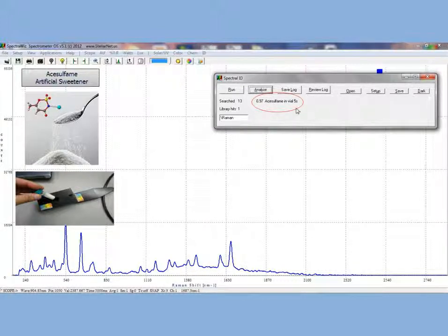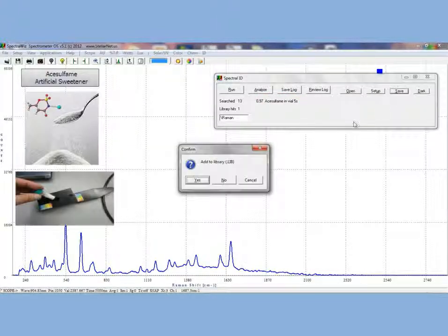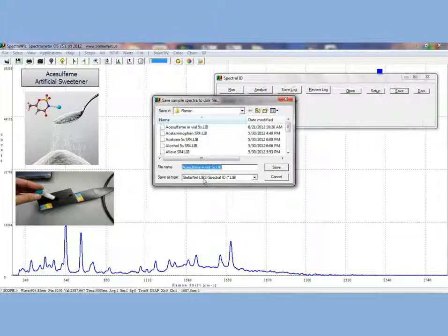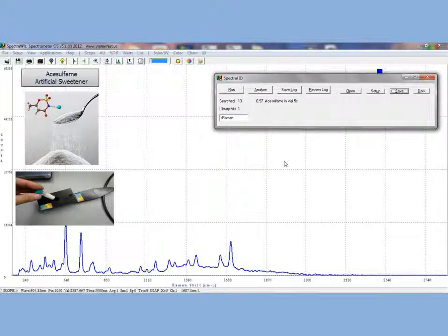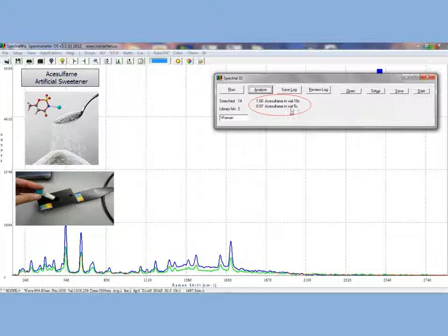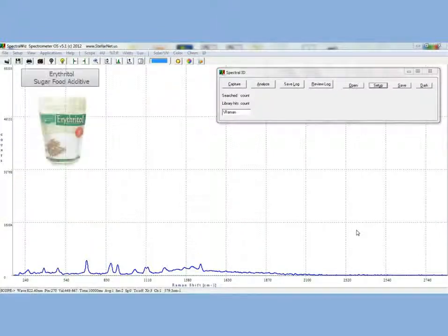Now hold down the red laser button and collect the spectrum at 10 seconds acquisition time. If you click analyze you see you have a 97% match for acesulfame in a vial at 5 seconds. Now let's add the 10 second spectral acquisition to the library. When we click analyze we will see both of them pop up on our match. You can clearly see that the integration time set with 5 seconds and with 10 seconds give you similar results.